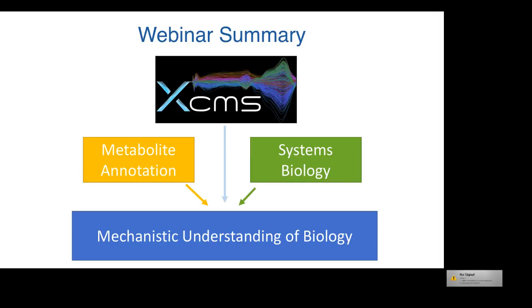But when we see many metabolites behaving similarly that should be assigned to the same pathway, that gives us a lot of confidence that that's probably the correct answer, and that's where that associated p-value comes from.